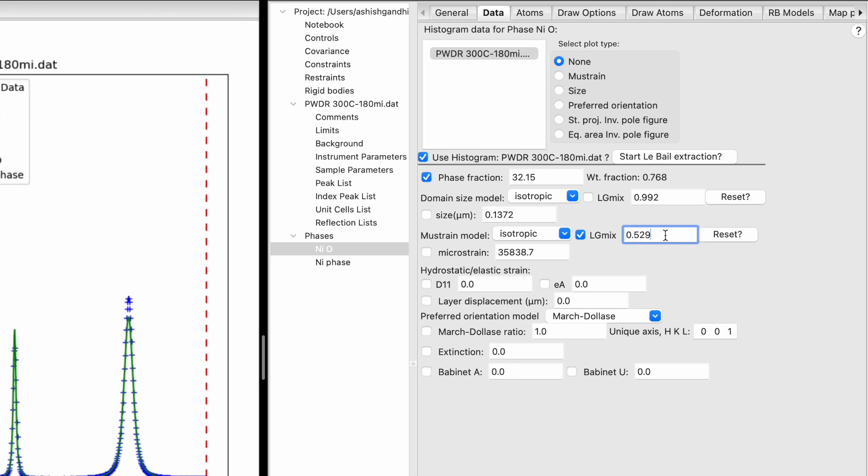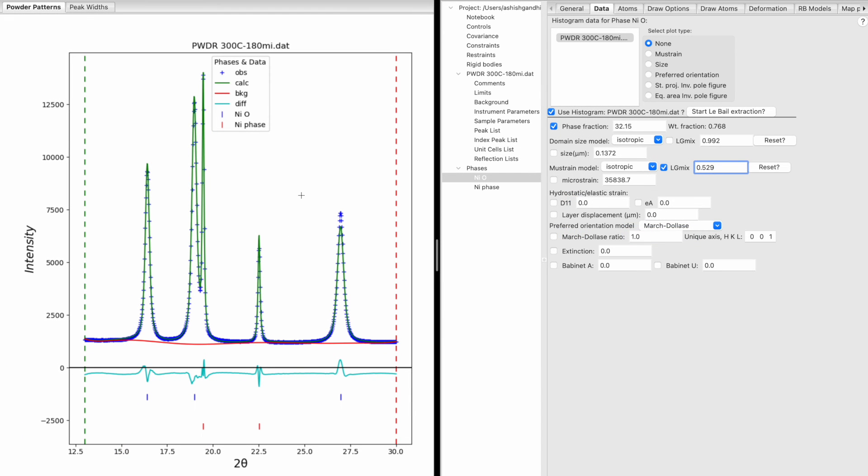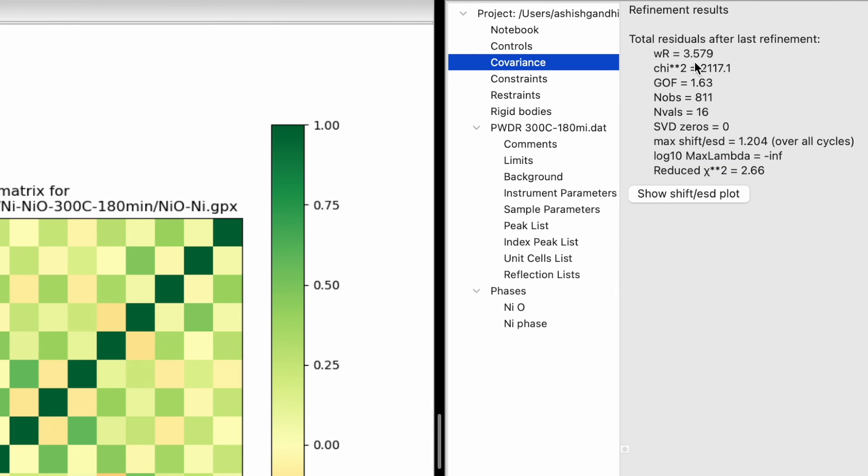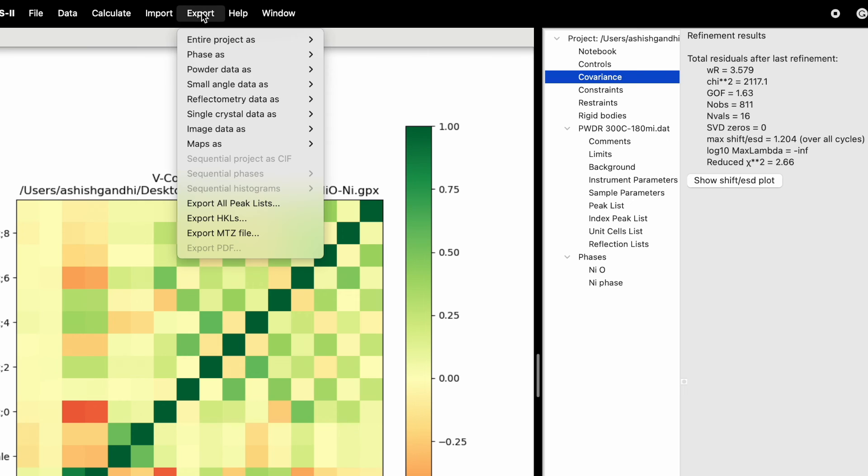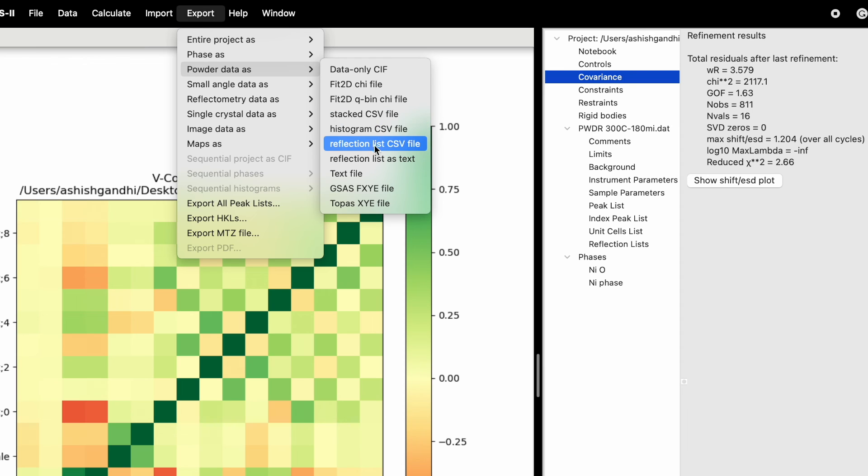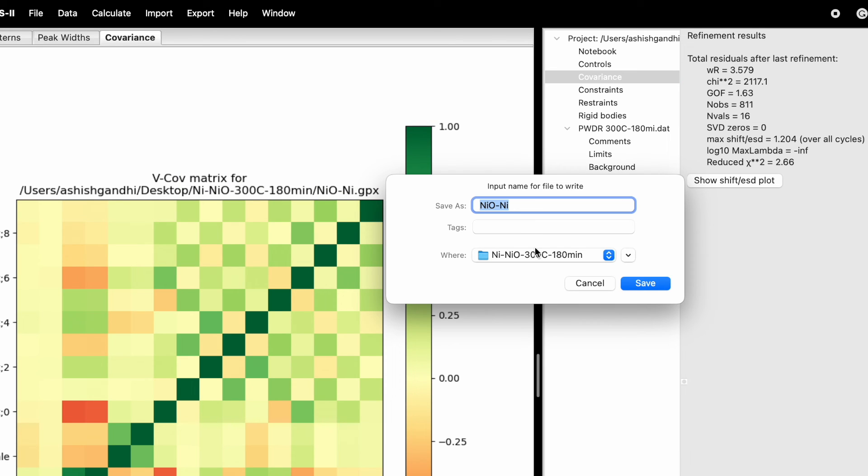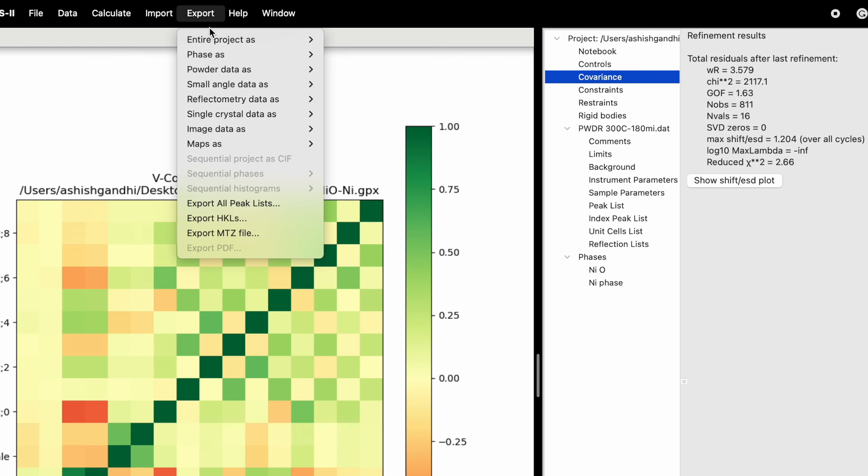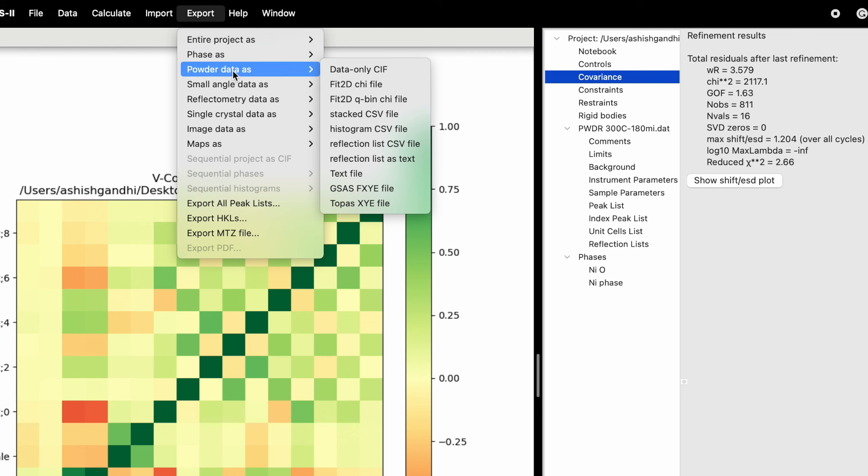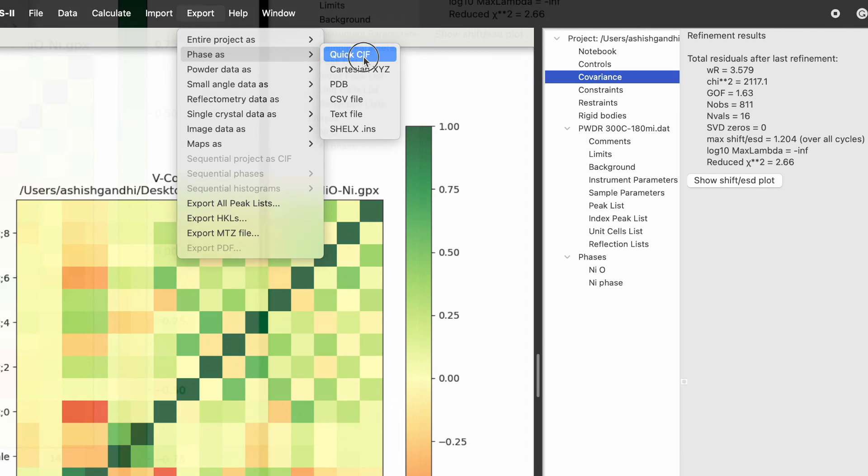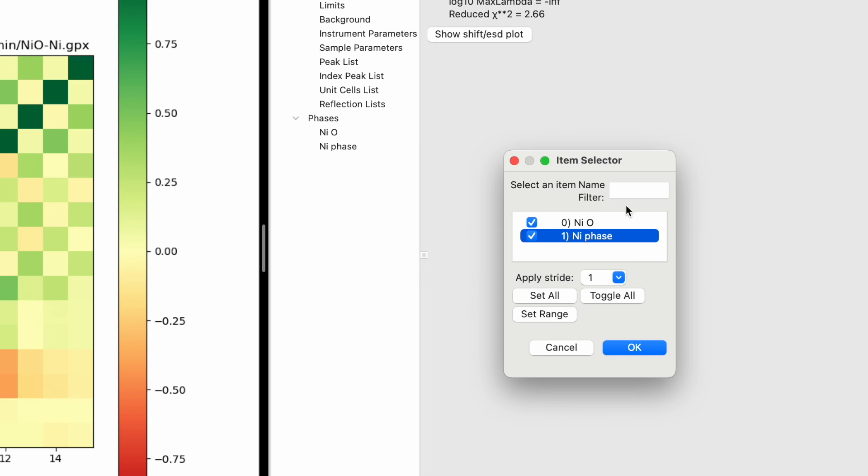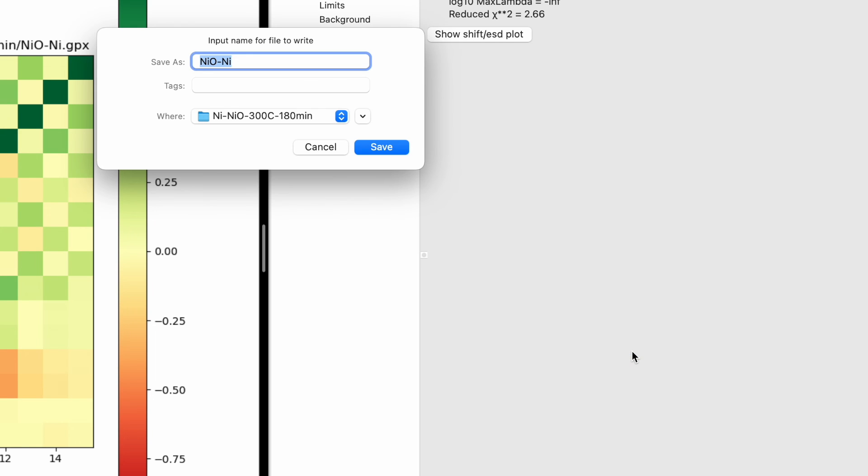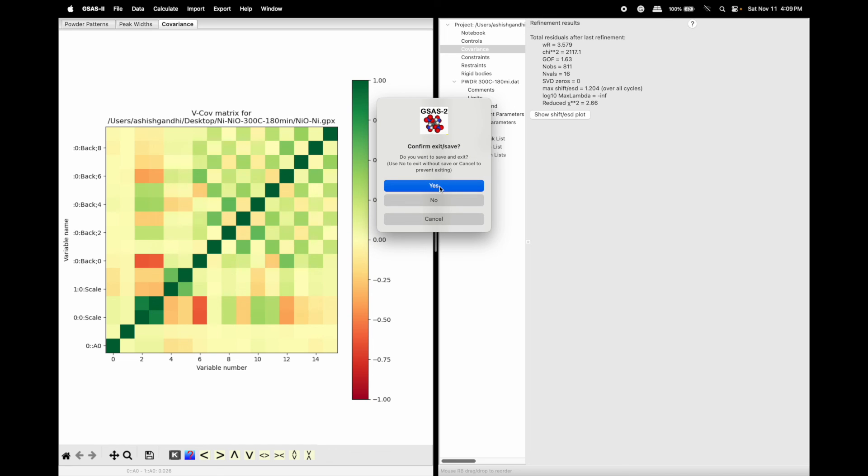This completes the Rietveld refinement of multiple phase XRD data using covariance. You can see the Rwp, reduced chi-square, and goodness of fit. To export, click Export, go to Powder Data As, choose Histogram CSV file and save. Then export Phase As Quick CIF, selecting both nickel and nickel oxide.